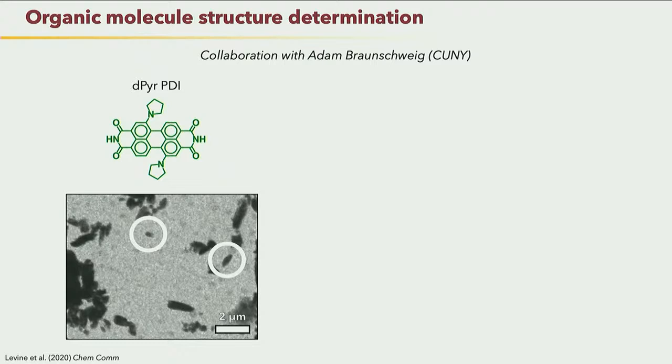And so we solved the structure without knowing that, and then could directly compare with the X-ray structure and see how closely they match. So this is this small molecule right here. If you take this sample, which is dissolved in some solvent, I forget which one, some sort of dichloro something, and they put this sample right on the grid and let the solvent evaporate. The result is you get little crystals all over the grid.